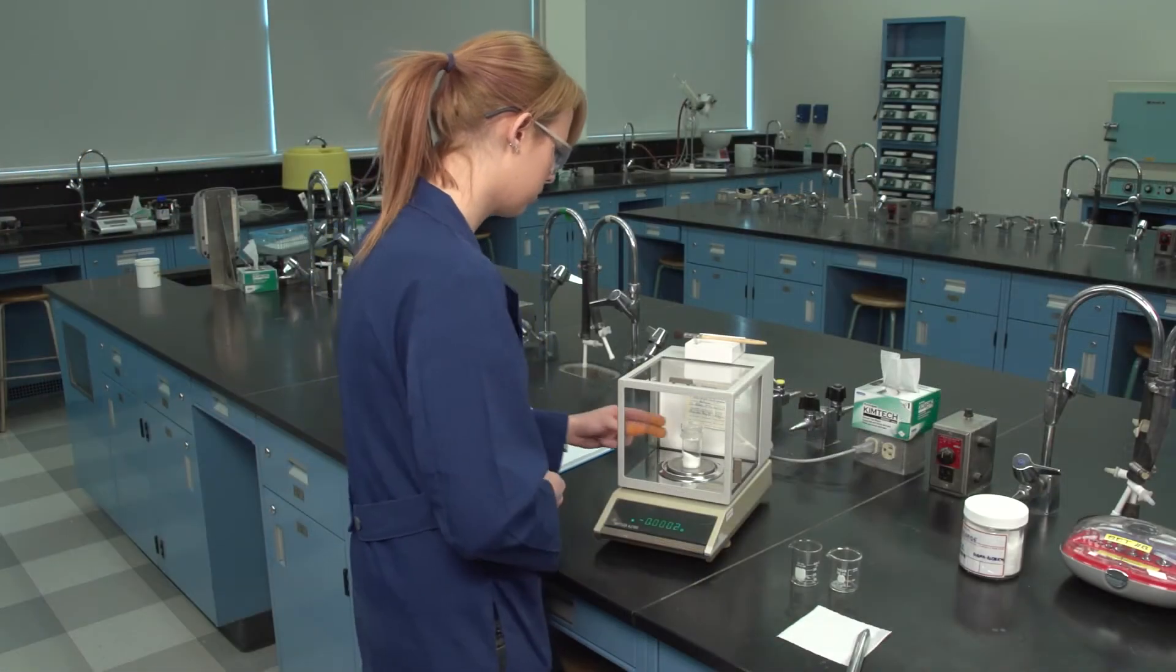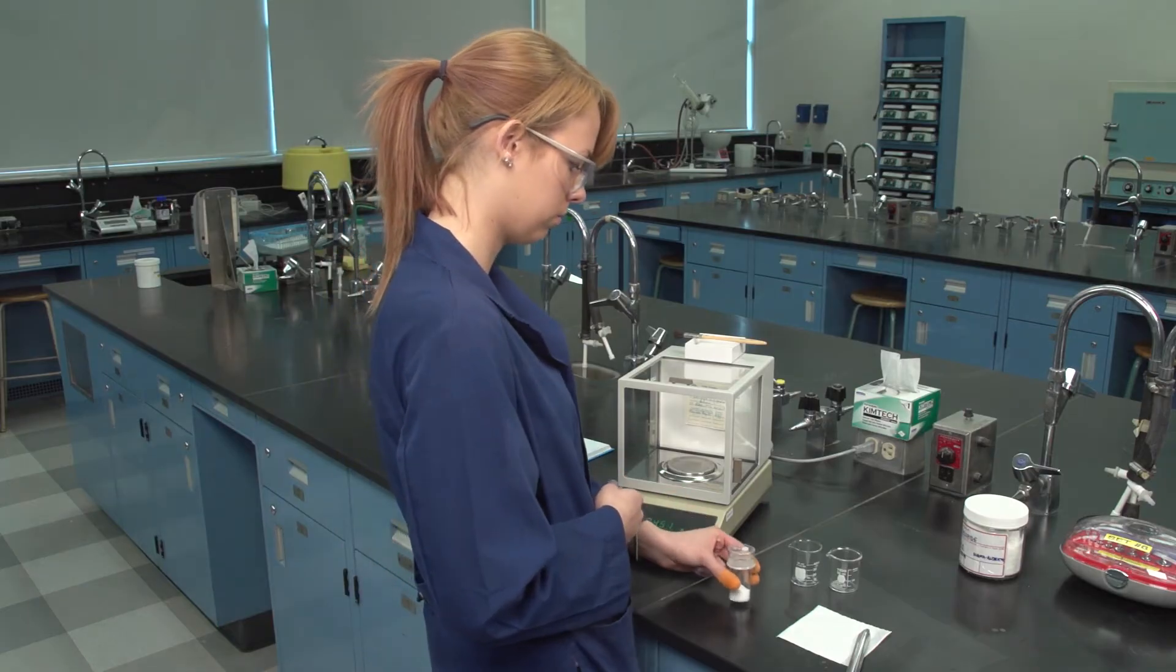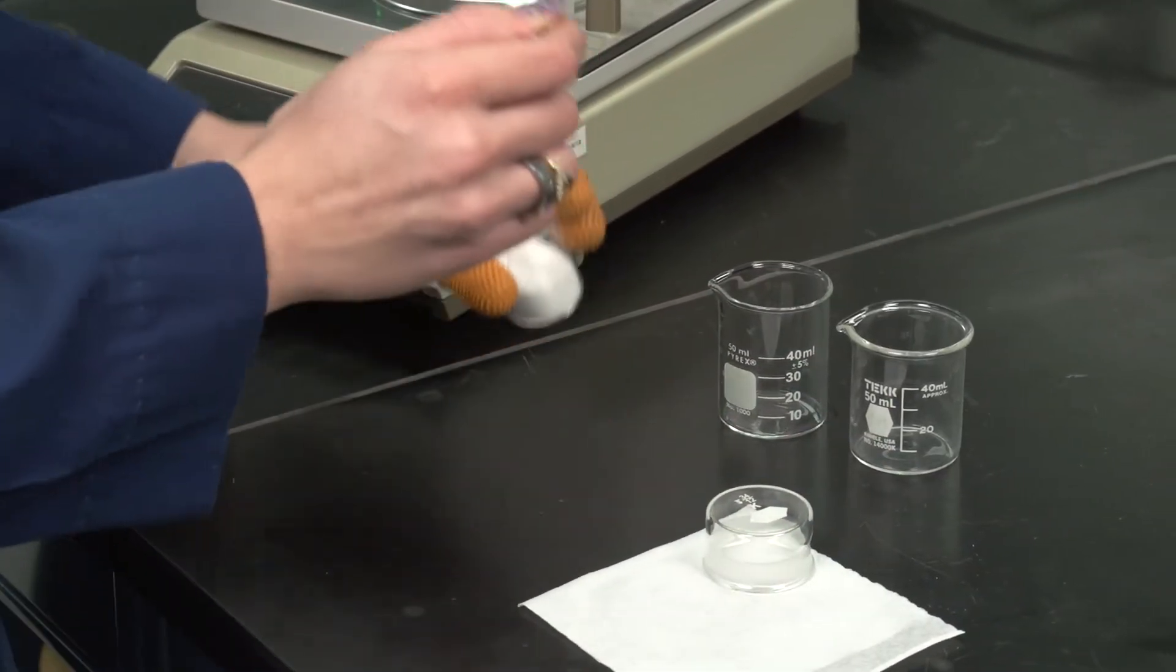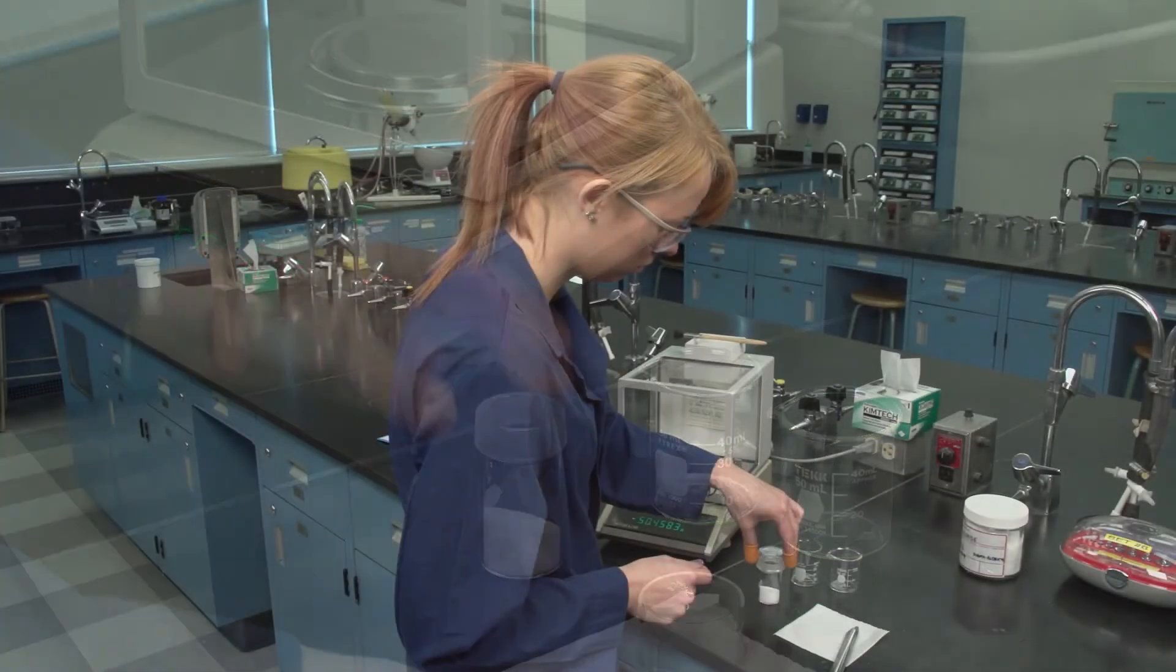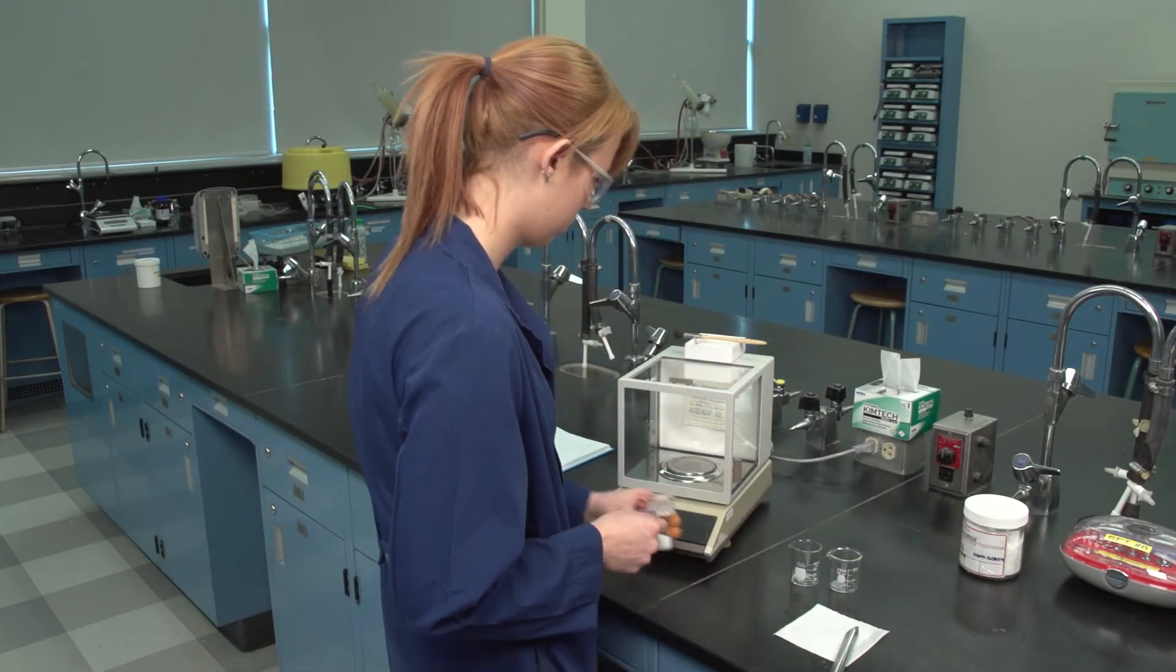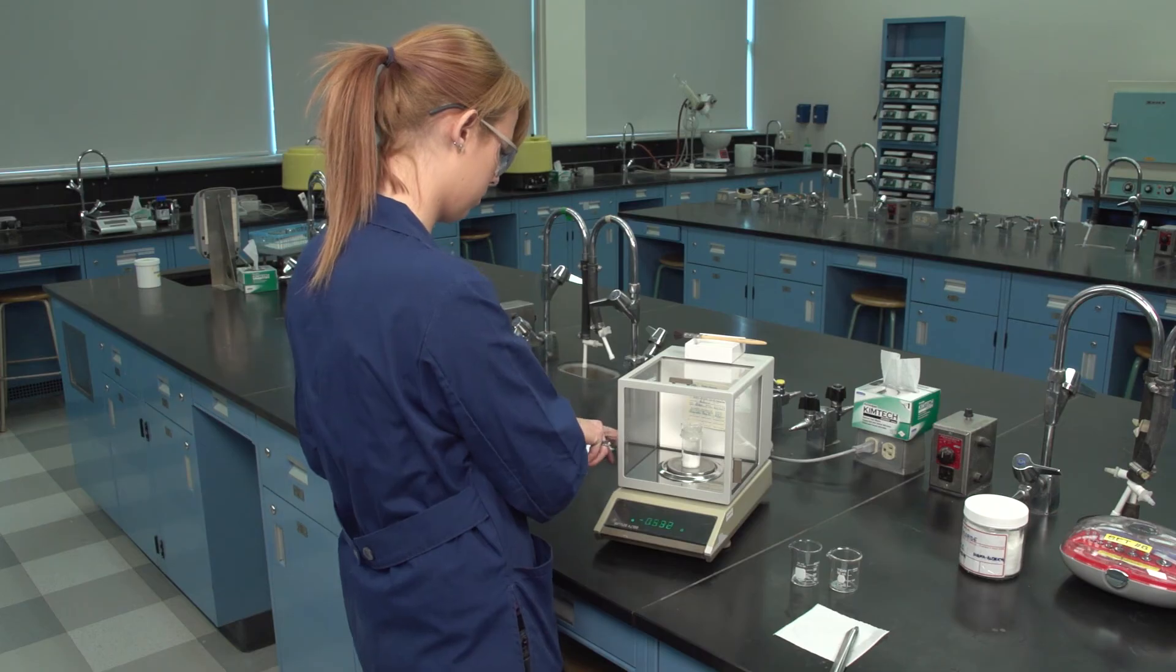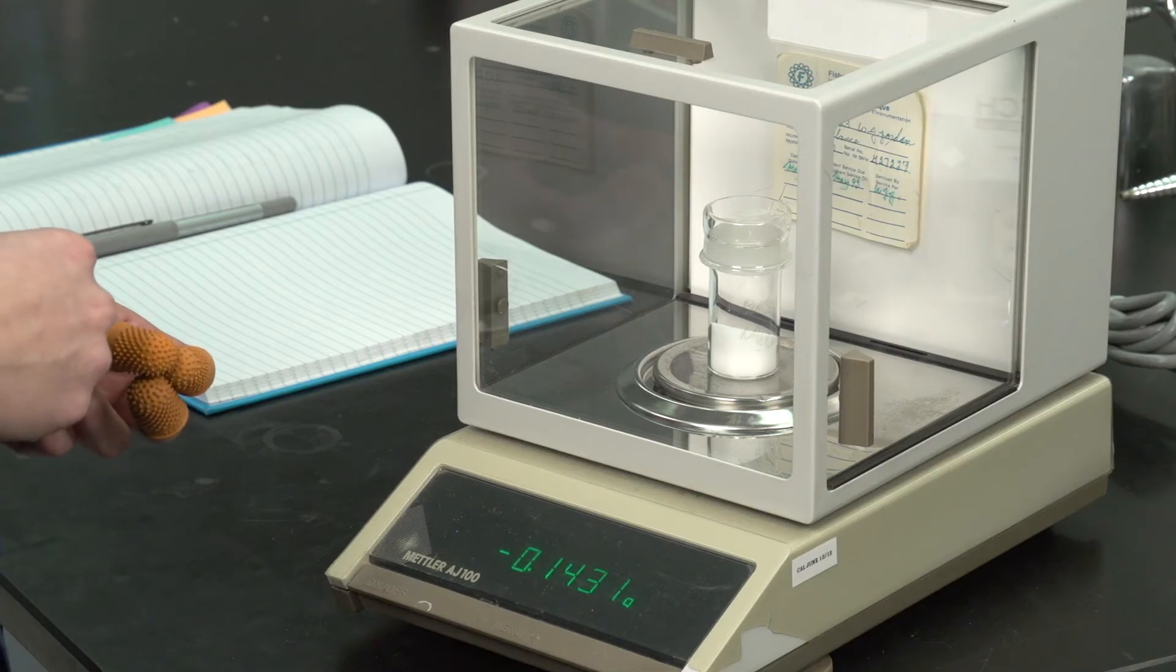Remove the weighing bottle from the balance. Remove some sample with a spatula and transfer to a receiving vessel. Return the weighing bottle to the balance pan and allow the balance to equilibrate. The negative value indicated on the balance readout is the actual mass placed into the receiving vessel.